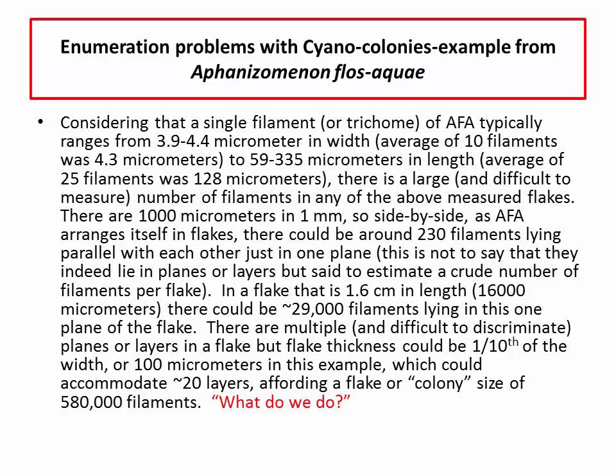So you're not going to count that. I'm not going to count it. But that's where we're at. And of course that's one colony. And in a mL you're going to have few hundred colonies. Well, you're not going to. I guess that's the answer. But there are ways to kind of get enough out of it.